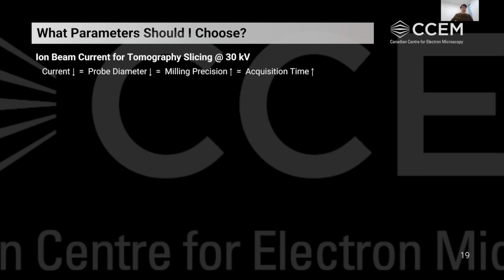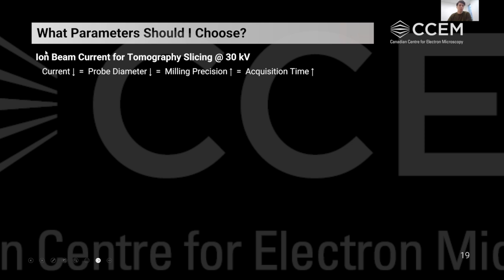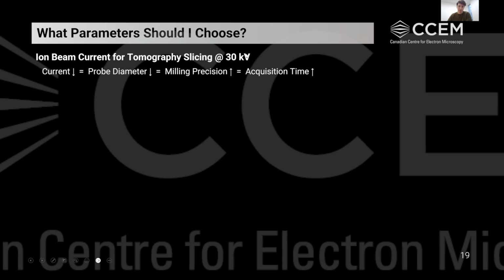So one of the questions we often get is what parameters do I need to work with if I'm setting up a FIB-SEM tomography run? And one of the important things to think about is what ion beam current you're going to use. Typically, the slicing is done with an ion beam voltage of 30 kilovolts. But the current is something that we're able to select based on our own preferences.